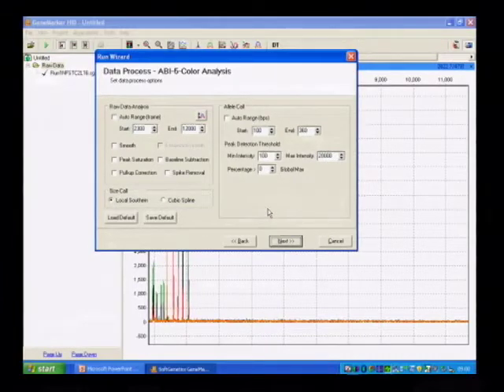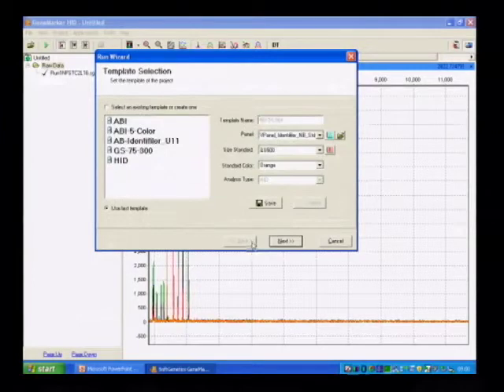So by going from that point, which is the raw data that's color corrected, it'll then place it into a format that can be used for allele calling, what you would normally use in your lab, I assume with GeneMarker or GeneMapper. So before I get there, I just wanted to show you what data looks like that's not color corrected through our trace processing software. So if we just imported our raw data into GeneMarker, what you would see is essentially this.